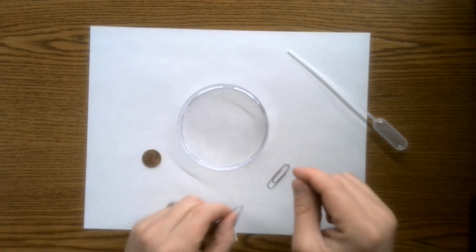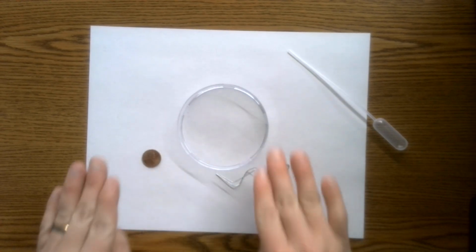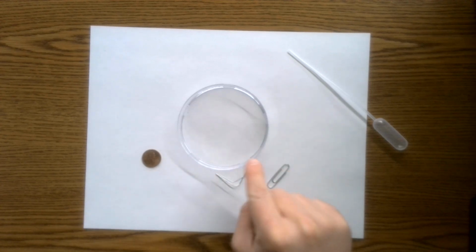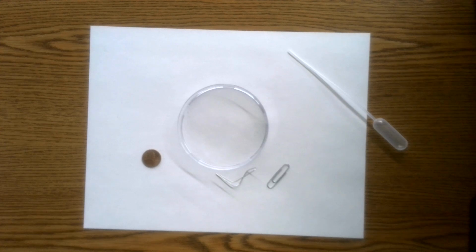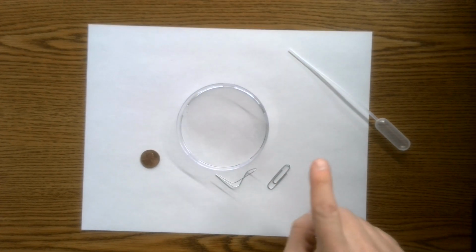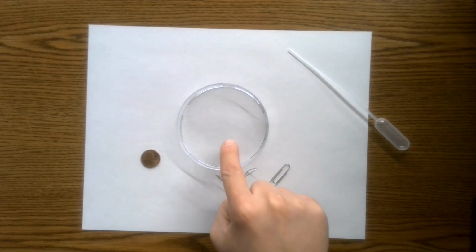Okay, now when you're done with this, all right, you've experienced surface tension. Those cohesive forces of those water molecules are making a bridge for that paper clip to sit on. You take a piece of soap. There'll be some over in the lab. There'll be a little tray of it. Dab your finger in the soap. It'll be in a petri dish like this.